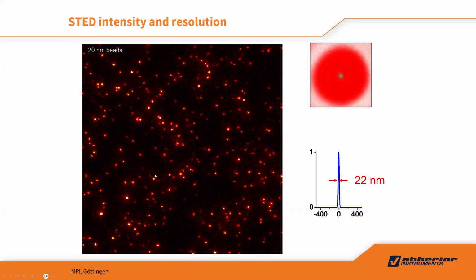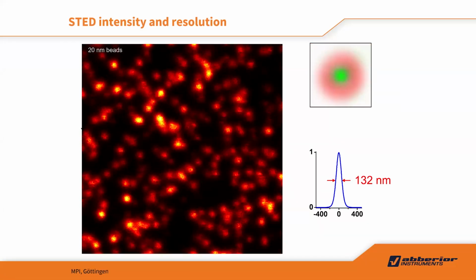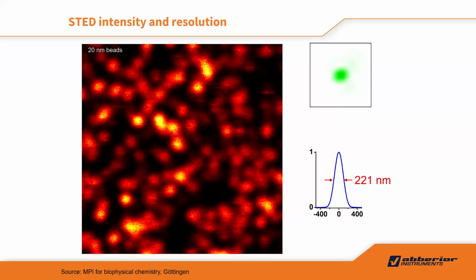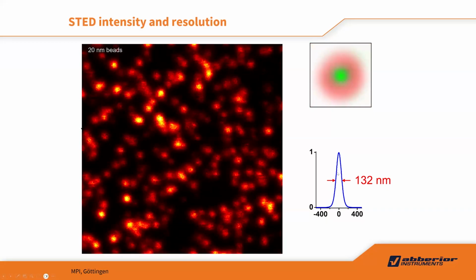So actually, our STED is a resolution-tunable system. If you switch off the STED beam, it's the optical perfect confocal system. If you switch the STED beam to the maximum the dye can handle, you get the best resolution. Normally, you do that on a fixed sample. And then in between, you can compromise the phototoxicity and the resolution for lifetime imaging, live cell imaging, and Z-stack volume imaging, as you wish.